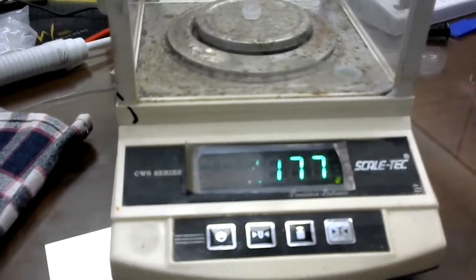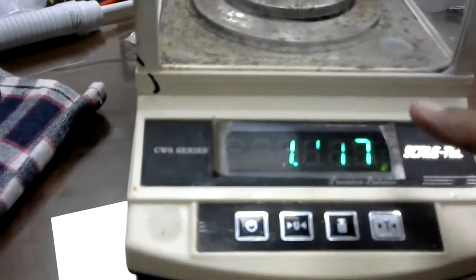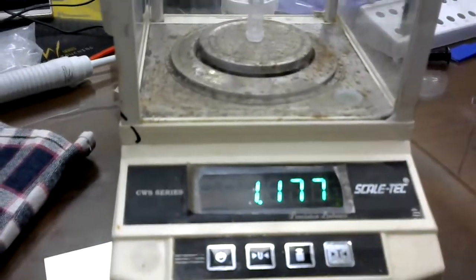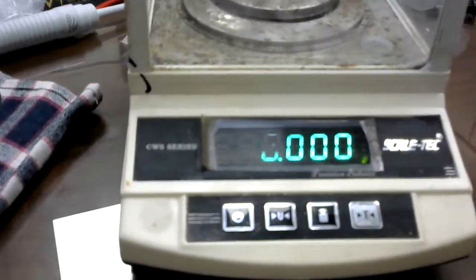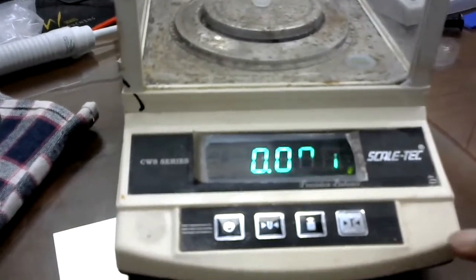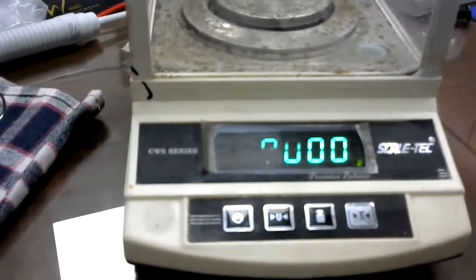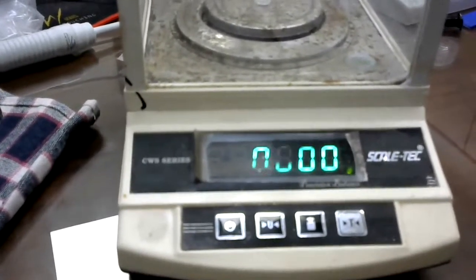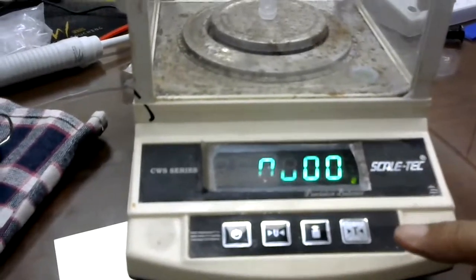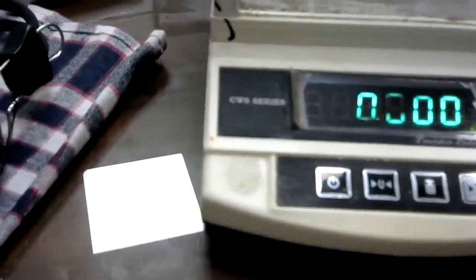Now I want to measure something, so I would like to make the weight of this tube 0. You press the tare button. Now the weight of that tube is almost 0. Whatever weight was there is nullified, so whatever you add in the tube will be measured. This process is called taring. Tare it and then weigh it.